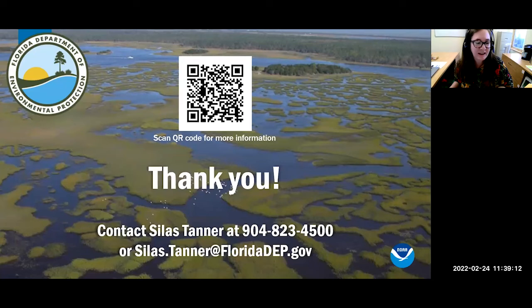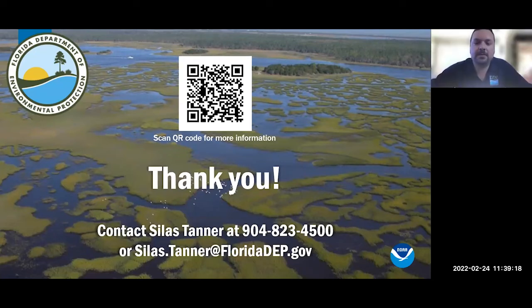Do you think you might implement these sensors in additional locations? Yeah, so we've got the sensors at all 4 of our system-wide monitoring program locations, and Olivia also has one deployed at the Michler site as well. So pretty much wherever we've got a data sonde in the water, we've got a chlorophyll sensor on there. So yeah, we're definitely all on board. We just need to do a little bit more research into comparing the extractive values against the fluorescence data.